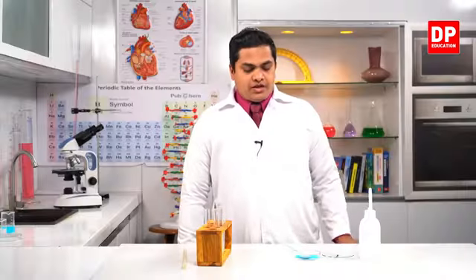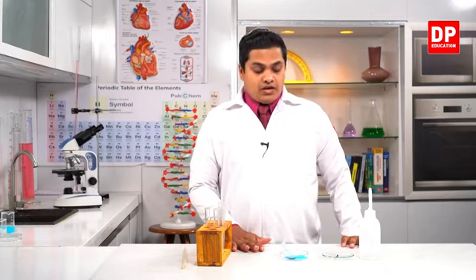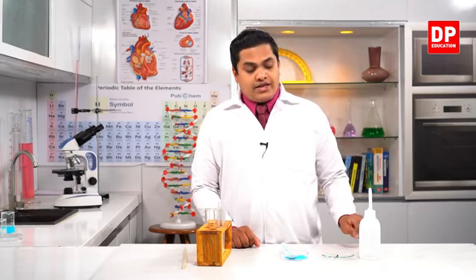Right, my dear children, now let's conduct this activity where we are going to use copper sulfate, right? We're going to make a solution of copper sulfate, and I'm going to add a piece of iron nail in here to see whether there is a chemical change or not.